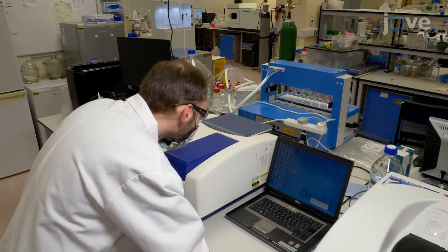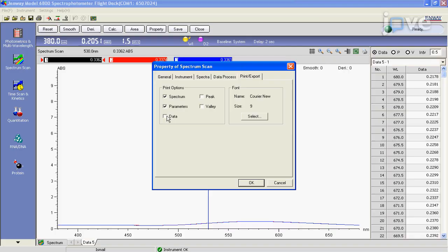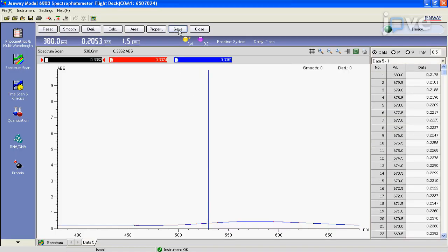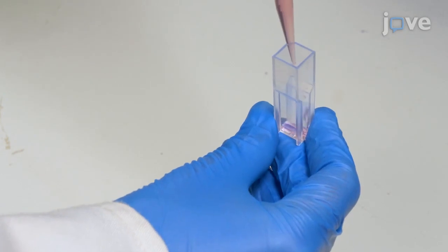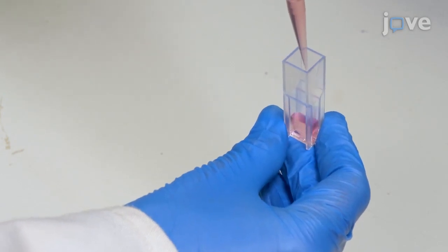UV-VIS provides non-invasive and fast real-time screening and evaluation of nanomaterial characteristics using simple absorption measurements. UV-VIS is exceptionally straightforward. The samples require little preparation and the software has few variables and is easy to use.